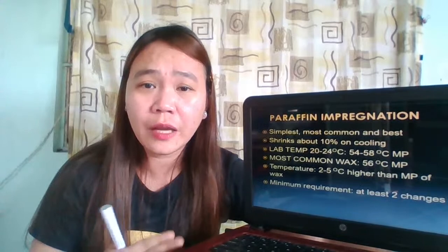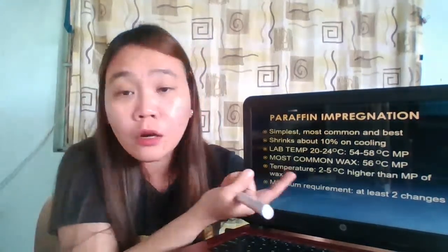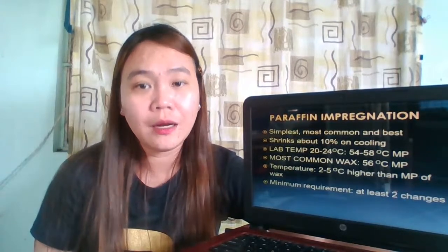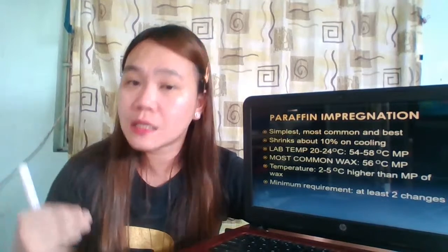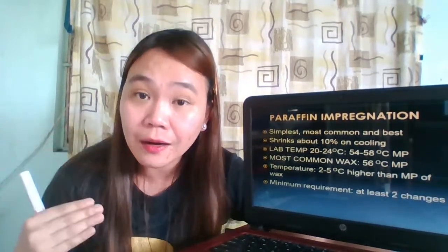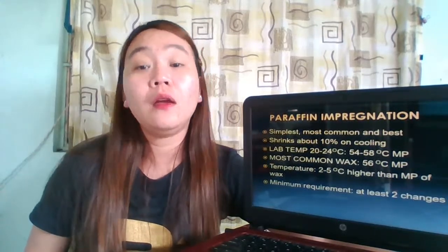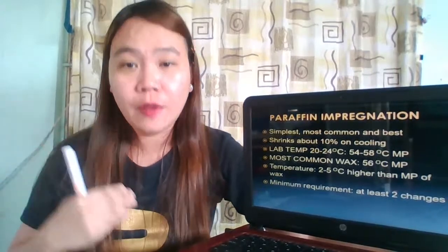The unit here is not just degrees Celsius. You should include higher than the melting point of the wax. Otherwise, your answer is considered wrong, because 2 to 5 degrees Celsius is different from 2 to 5 degrees Celsius higher than the melting point of the wax. What is the required temperature? 2 to 5 degrees Celsius higher than the melting point of the wax.